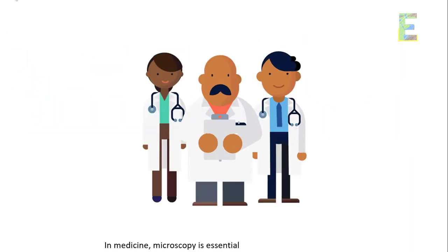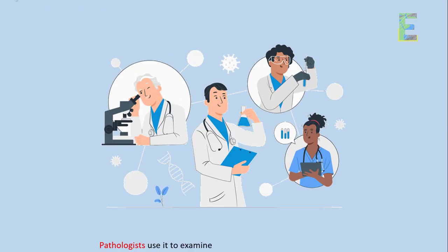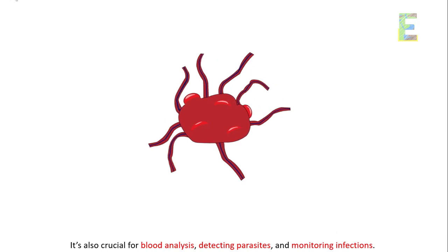Medical diagnostics. In medicine, microscopy is essential for diagnosing diseases. Pathologists use it to examine tissues and identify abnormalities. It's also crucial for blood analysis, detecting parasites, and monitoring infections.